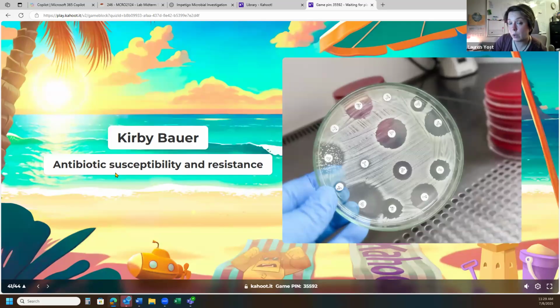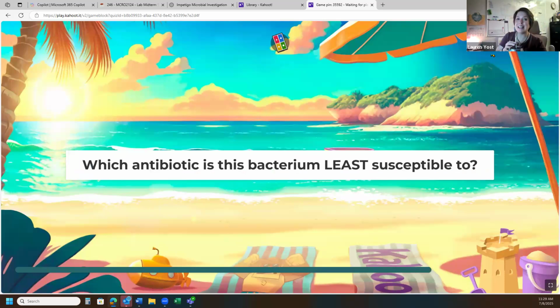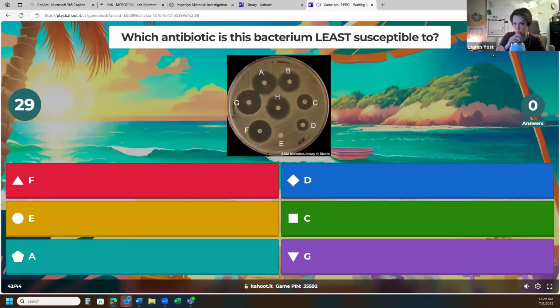Are we tracking? Do you guys have any questions about that? Because there was some confusion about that on that lab exam or lab worksheet. Any questions about that? All right, here's our question. Which antibiotic is the bacterium least susceptible to?